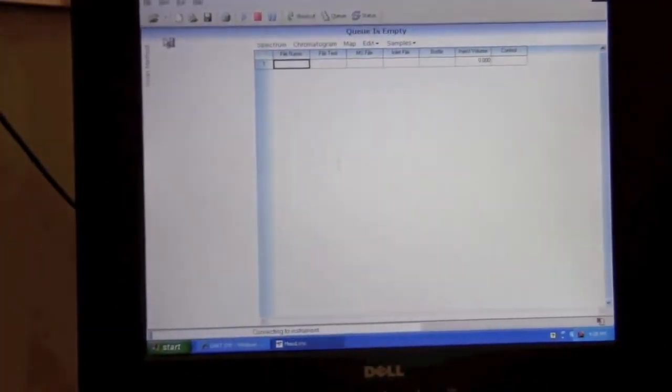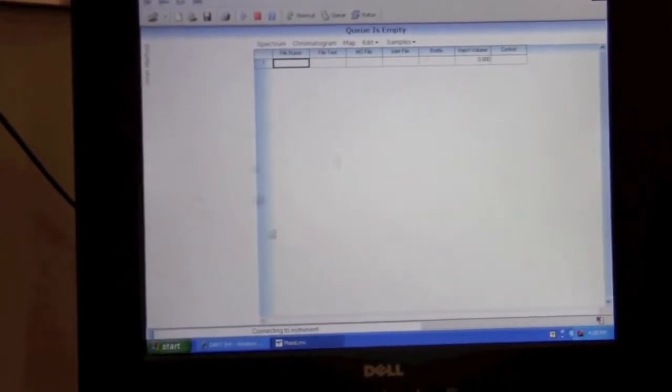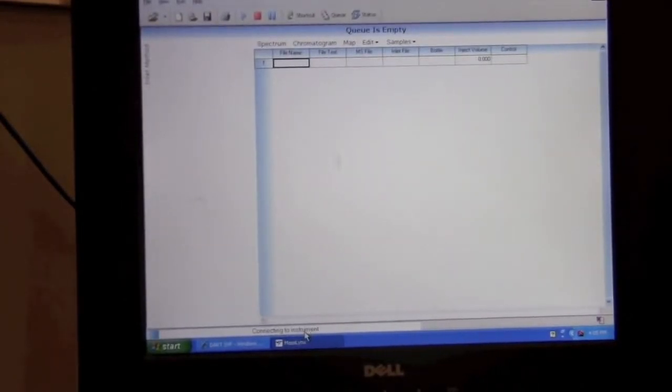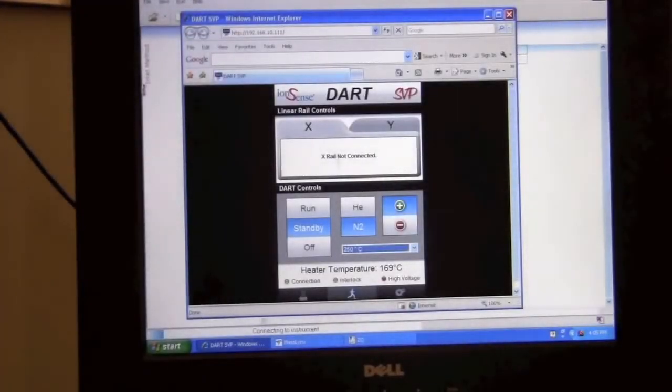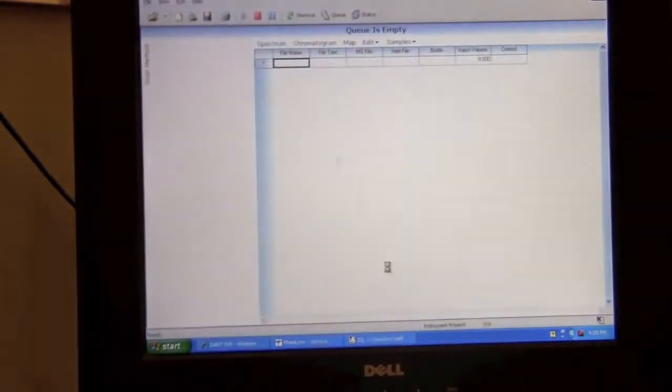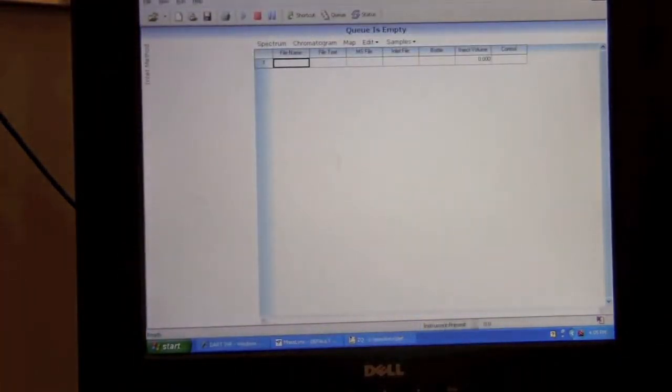Once the Mass Links main page has started, it will say connecting to instrument. And if everything is correct, it will say instrument present.